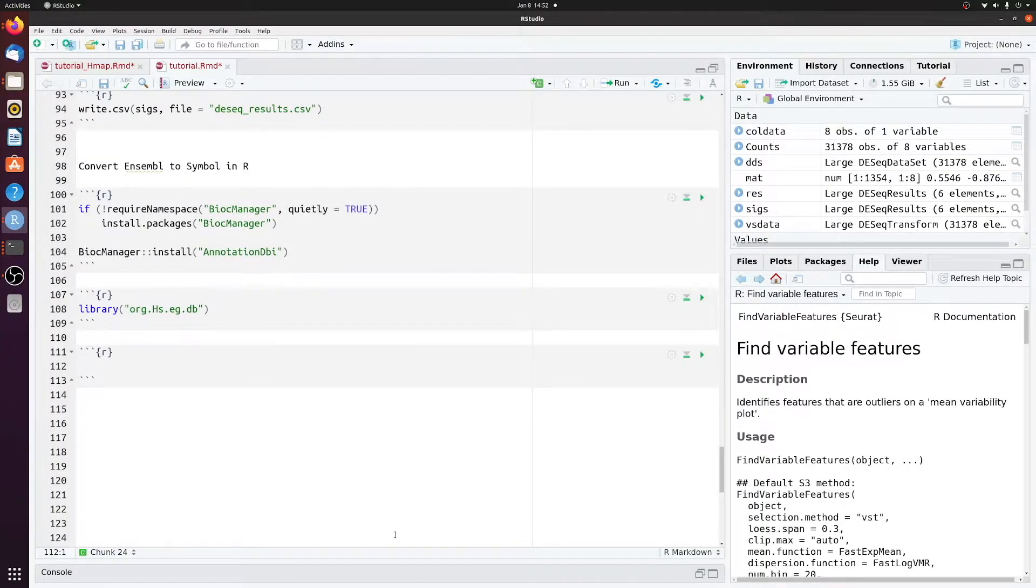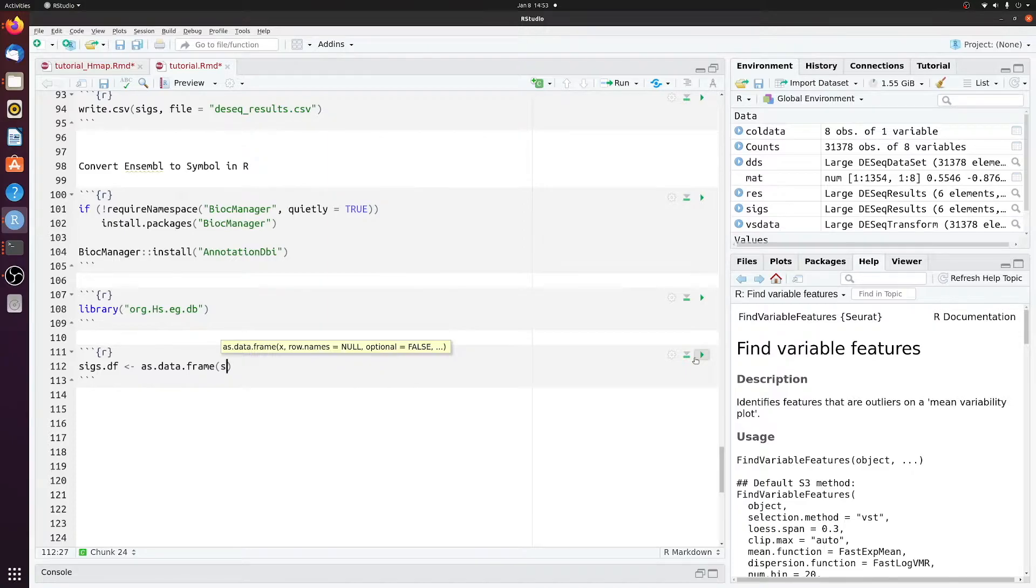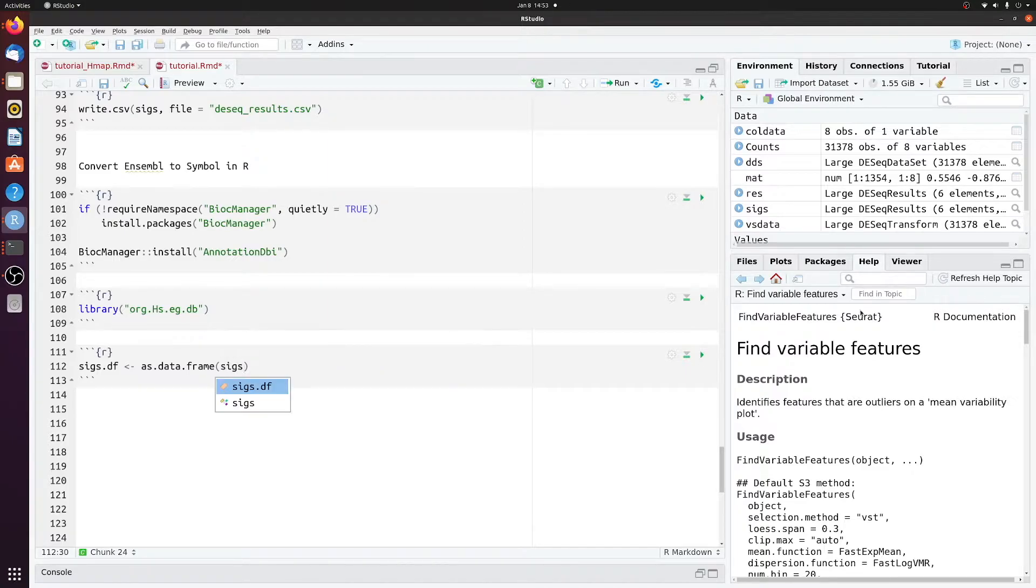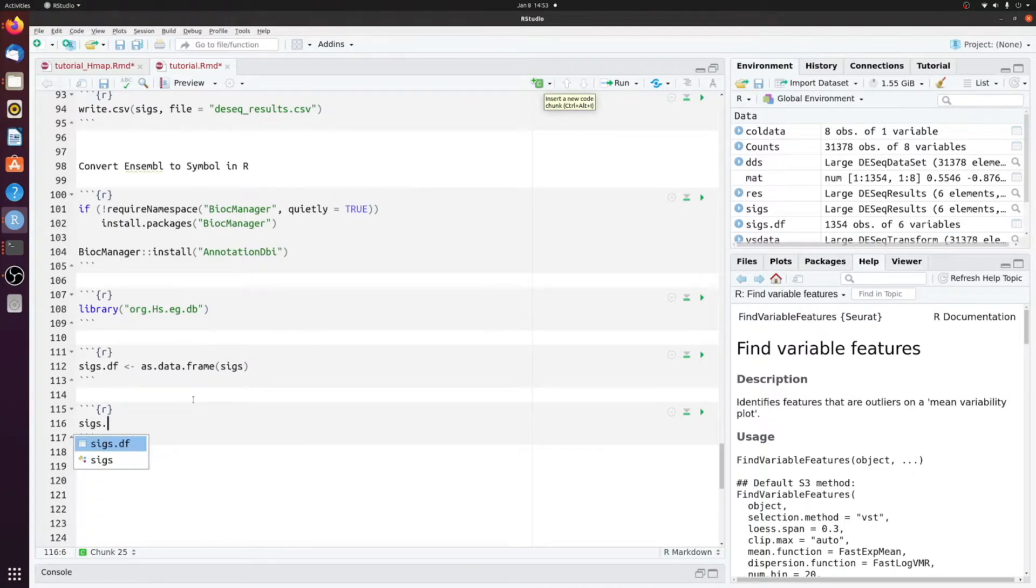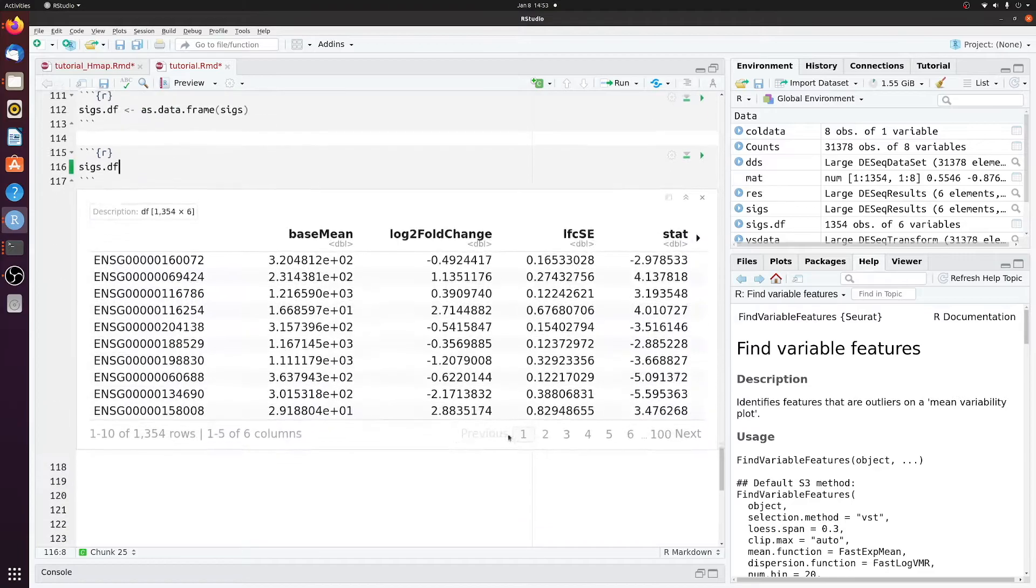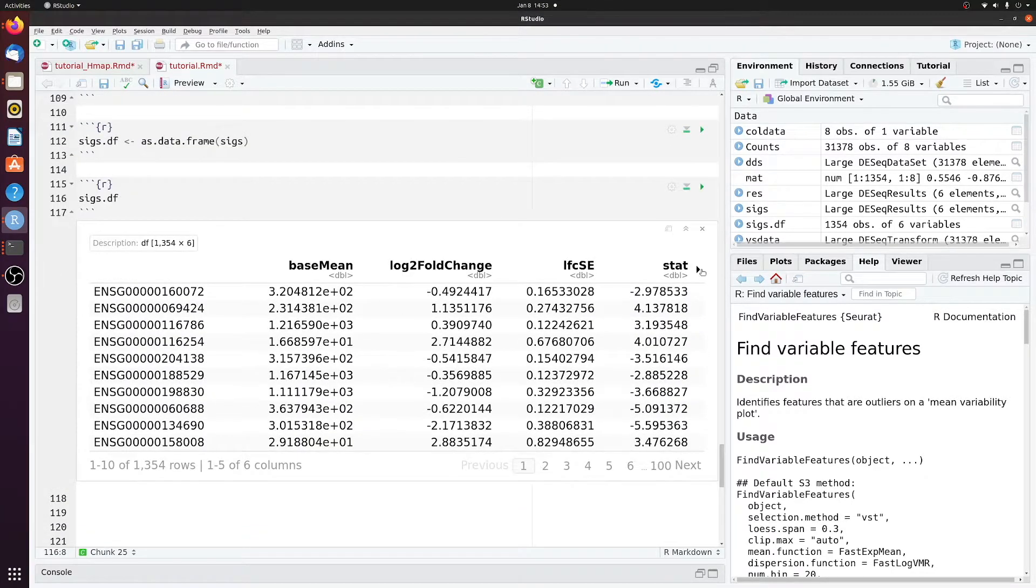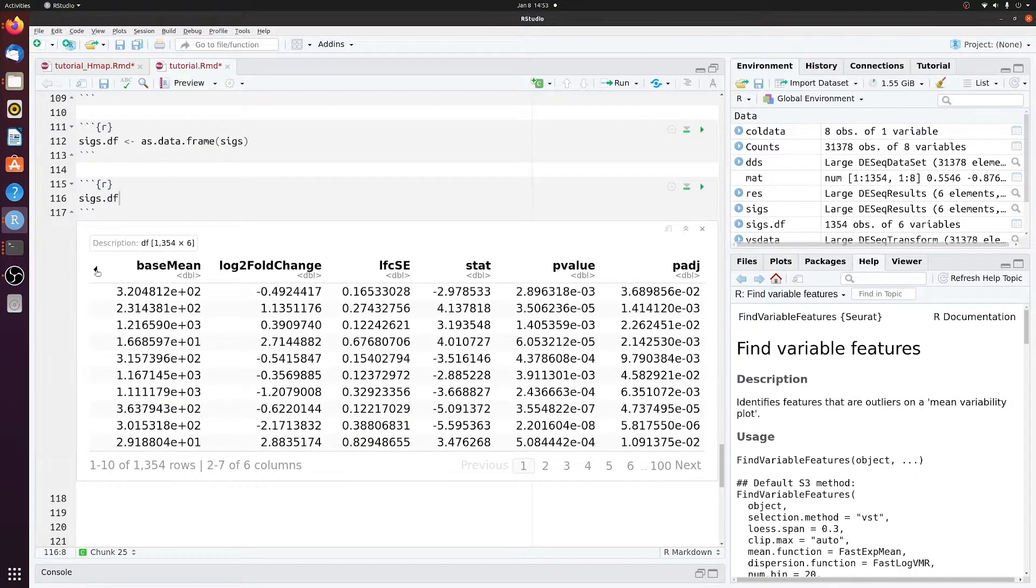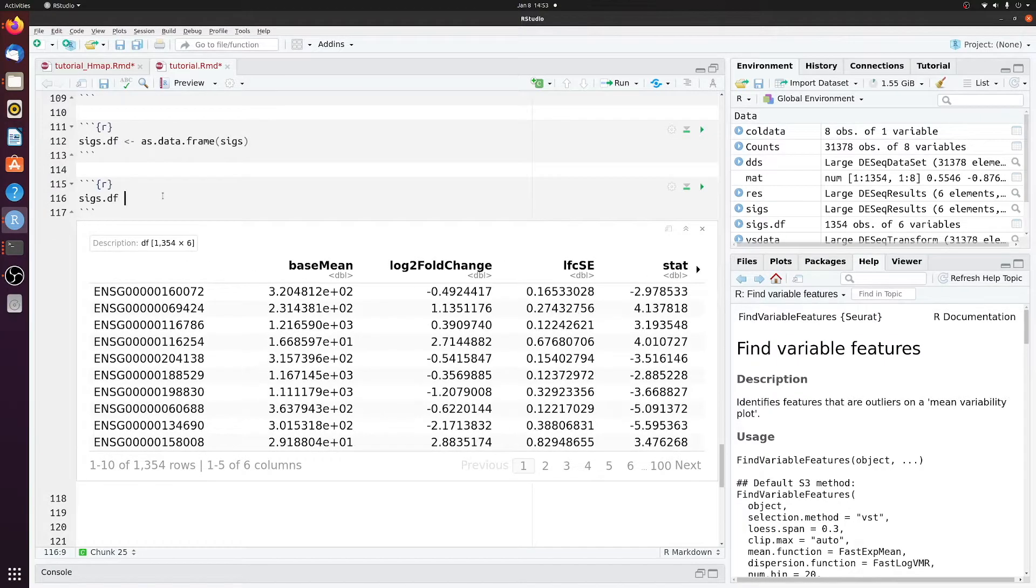And then let's just convert SIGs to a data frame. So we'll just do as.data.frame(SIGs). So now if we look at SIGsDF, we just have the differential expression table in a data frame.